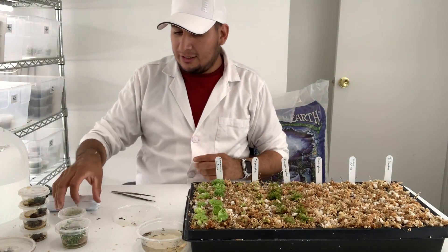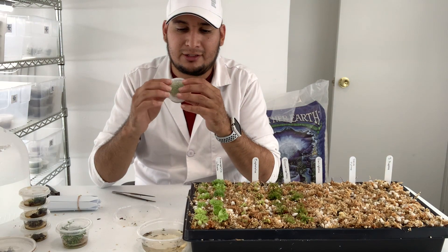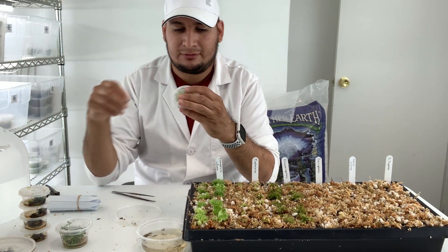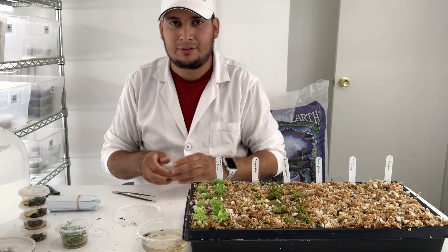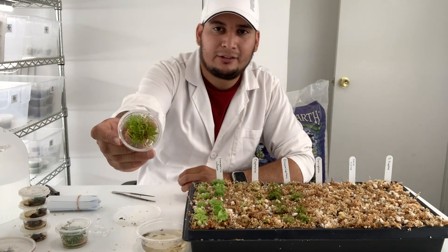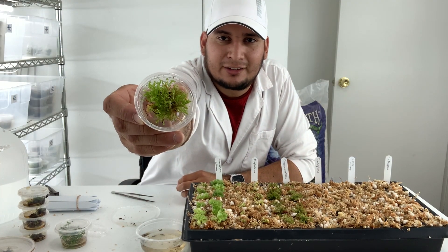Next plant is Darlingtonia californica — this little guy. Let's open this up. Look at these guys, they are tiny.